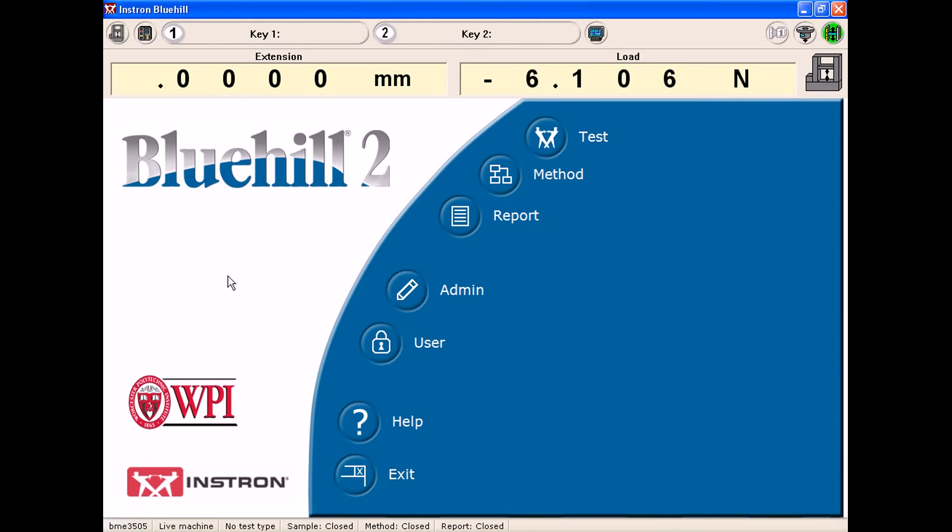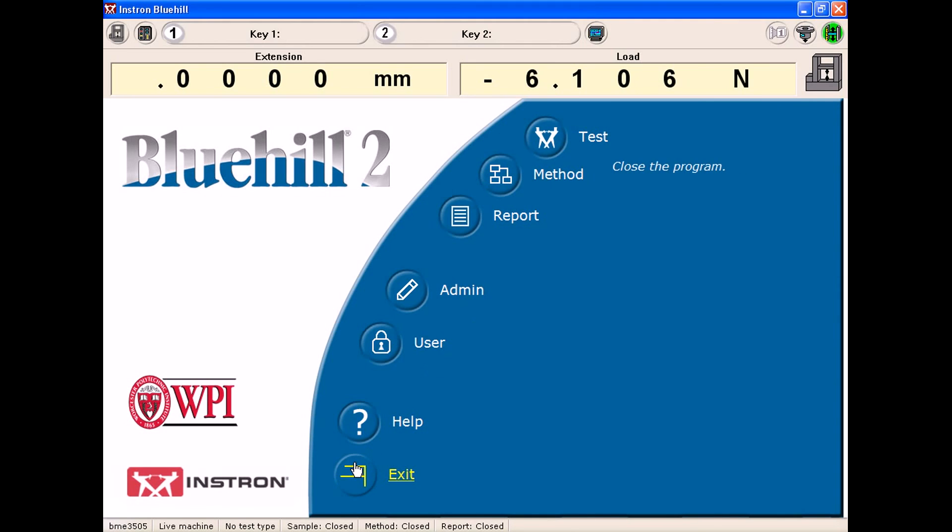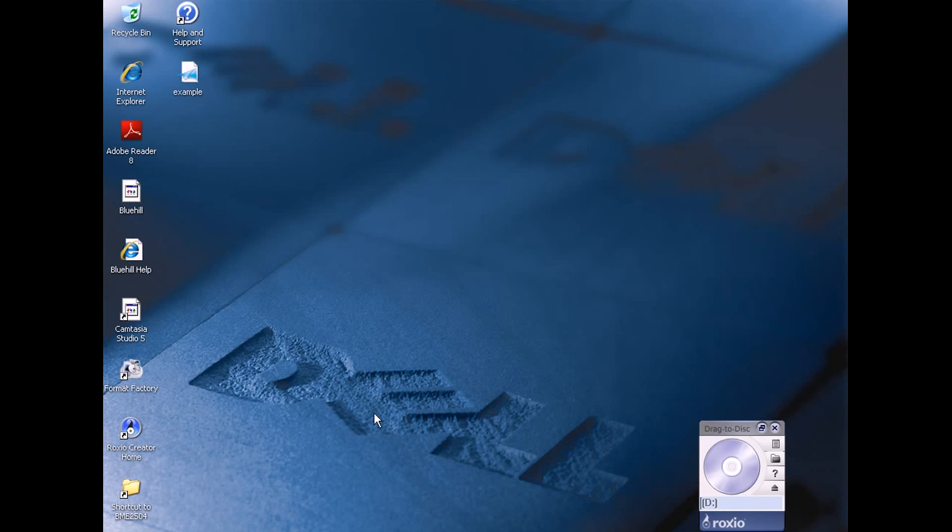And in order to close out the Bluehill software without it ruining the Instron, we need to close the Instron, the Bluehill software one way, and it's using exit at the bottom of the screen. If you hit X at the top right-hand corner of the screen, it will not work and it will damage the Instron, so please do not do that. By hitting exit at the bottom, I am able to log out of Instron, Bluehill.